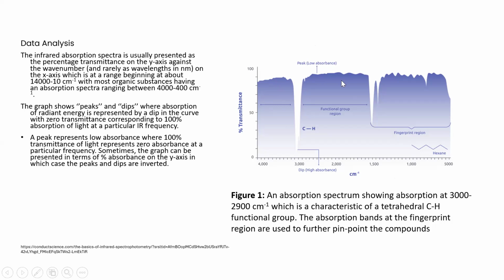So you are going to get these different types of peak sizes or bands which are going to be generated, and they are going to be specific for a specific molecule, functional group, specific bond, and what kind of bond activity has taken place by absorbing the light, whether the bond stretching happened, whether the bending of the bond happened. All these details also you can get to know. It is just to make you know how the graph is plotted.